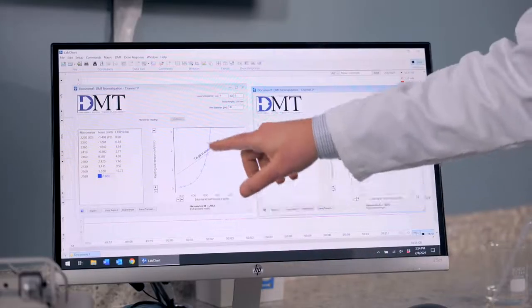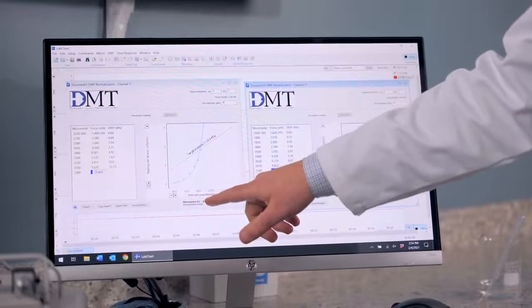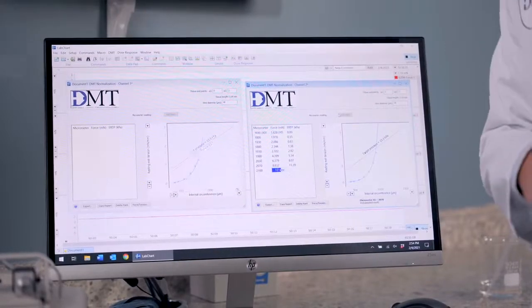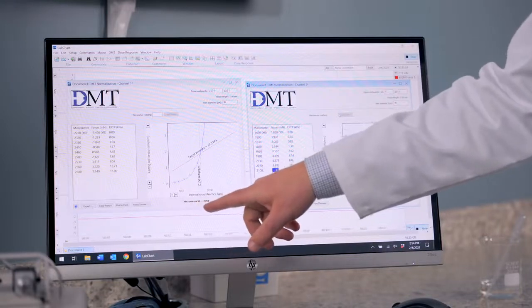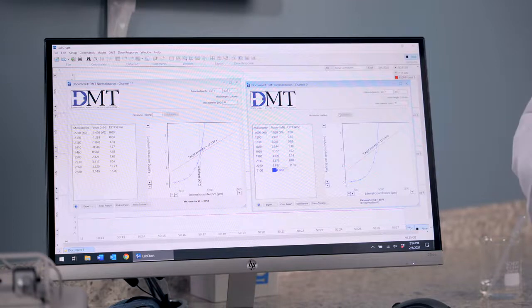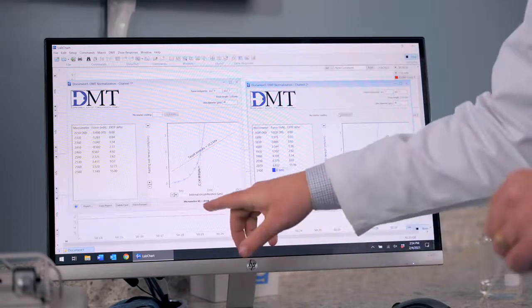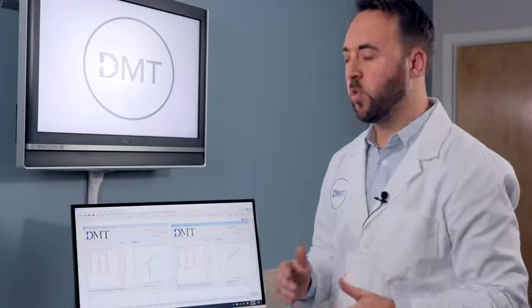You will notice while you're still below this line, you will see an extrapolated result under the best ideal micrometer setting. Once you have passed that line, as we have now, it no longer says extrapolated result, and it now tells you the point at which you should set your micrometer. So channel 1 suggests we set it to 2558. So we will get as close as we can to that number.